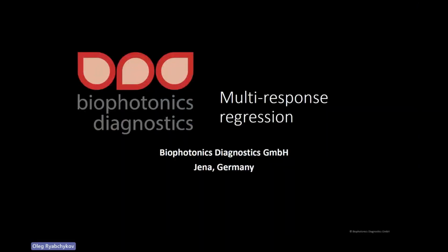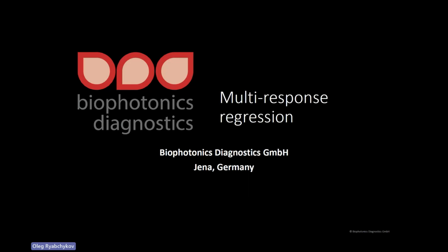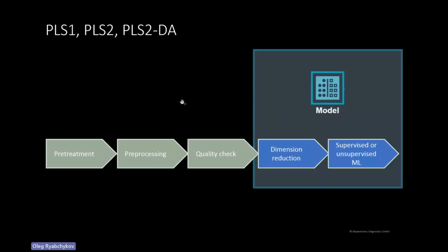Yes, thank you for the introduction and for already giving some idea about today's presentation. First I will start with conceptual things about data analysis, and specifically about multiple response regression, and of course specifically for Raman spectroscopy. Sorry for the screen. Today I will mostly talk about partial least squares regression, and I will mention such algorithms as PLS1, PLS2, as well as PLS2DA.